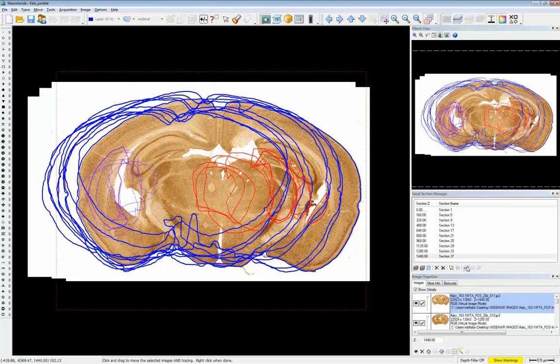But in less than a minute, I was able to take that disordered serial section file and bring them into close order. In addition, you could also use Control F to snap those contours and then just move the images using Move Image if you wanted.